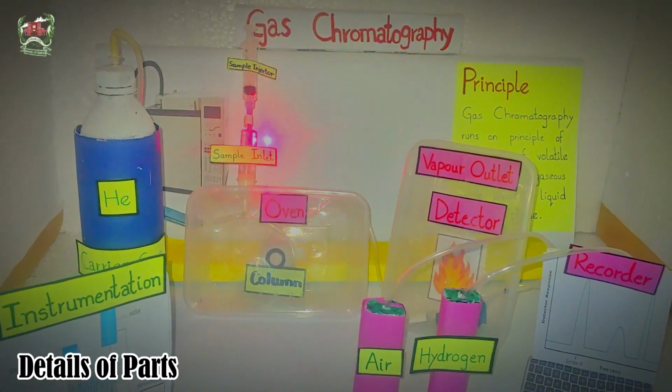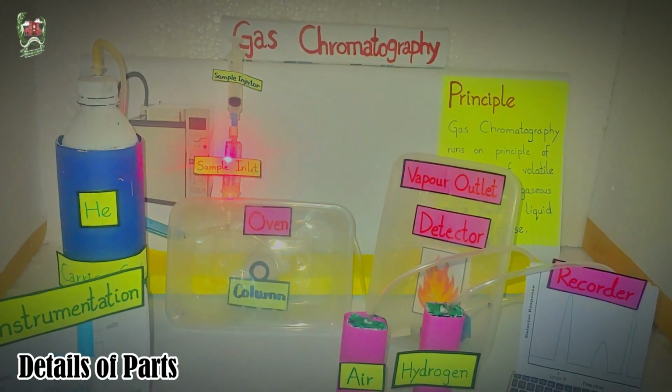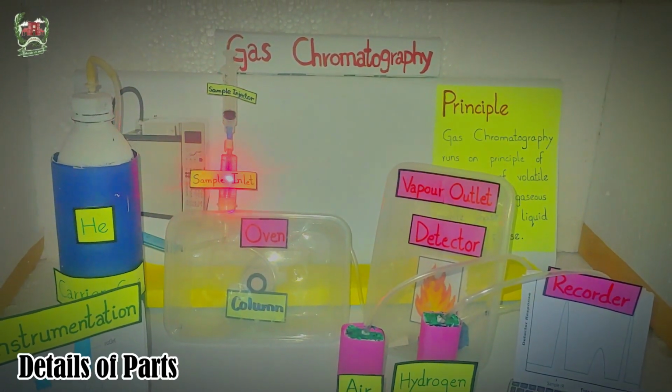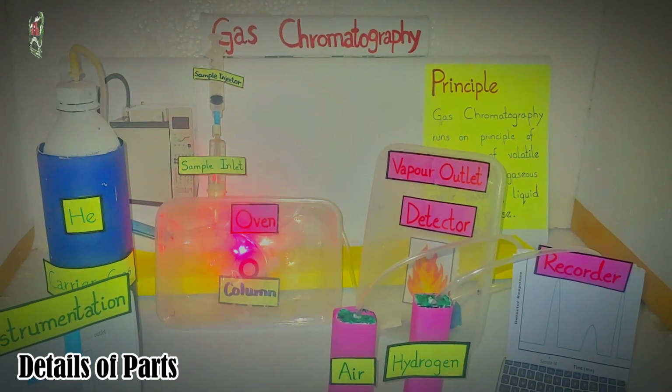Now coming to the sample inlet, where we can insert gas or liquid sample. If the sample is solid, then it will be dissolved in the liquid and converted into the liquid sample, and then it is injected. Next part of the GC instrument is the GC column.